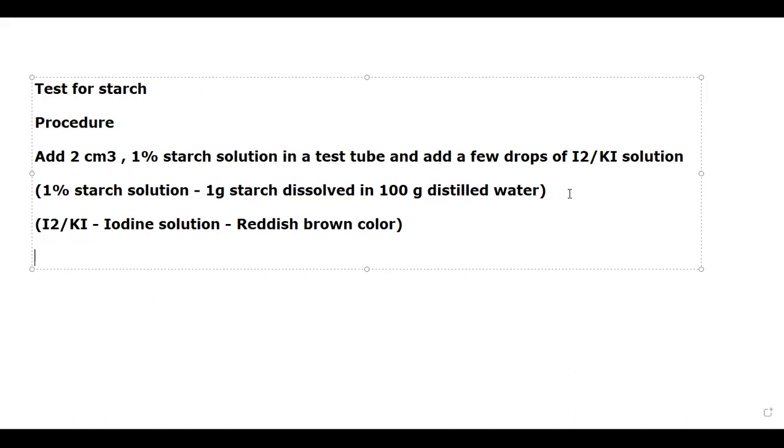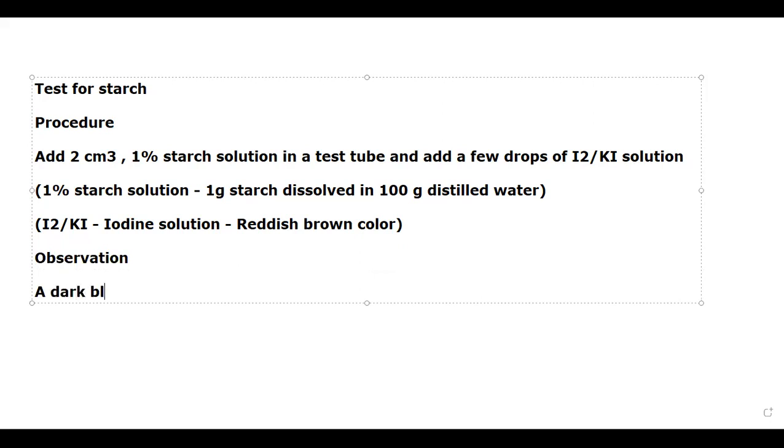Clear, sir. So what is your observation? Okay, dark blue or dark purple color solution will be obtained.